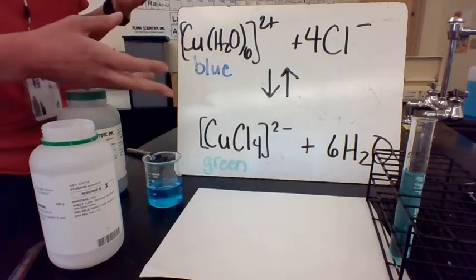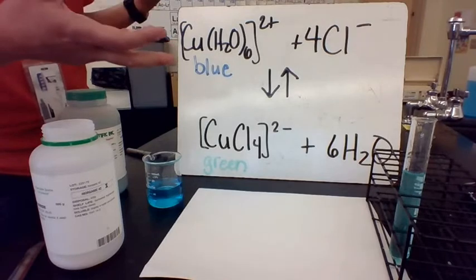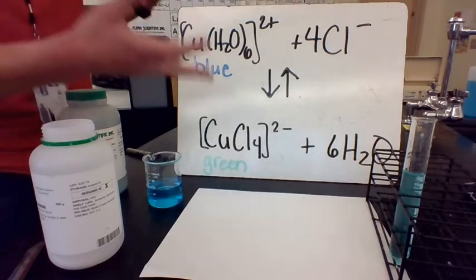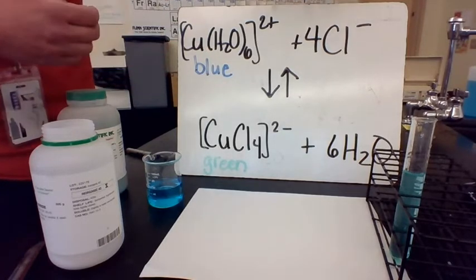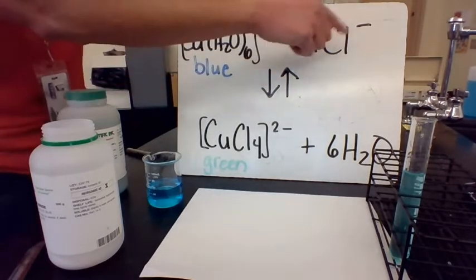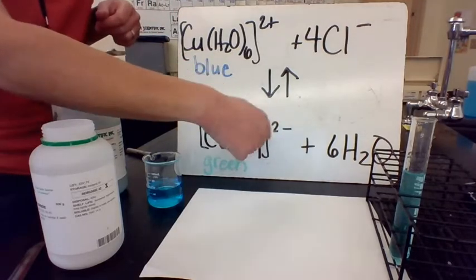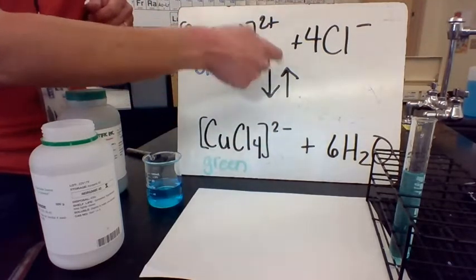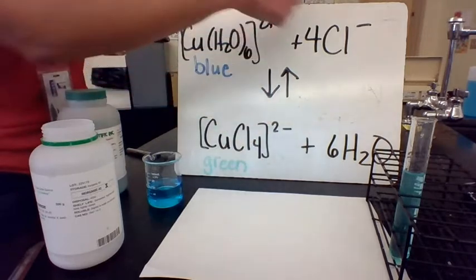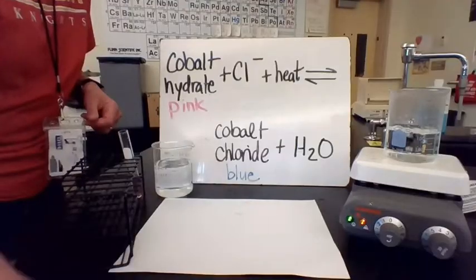And this is something known as Le Chatelier's principle, where we're talking about how a system will respond to a stress. So if you add excess reactants, we say the reaction shifts away from the stress to use up those excess reactants and turn them into products. If we add products, the reaction is going to shift the other way and use up this excess products and turn them back into reactants. So that's what we just saw happen here.